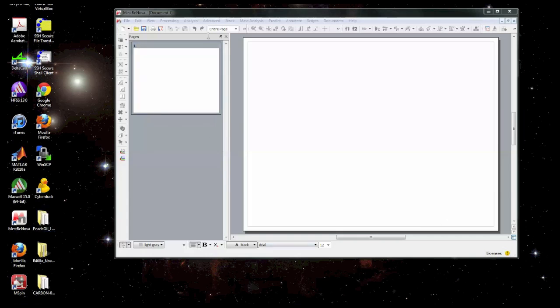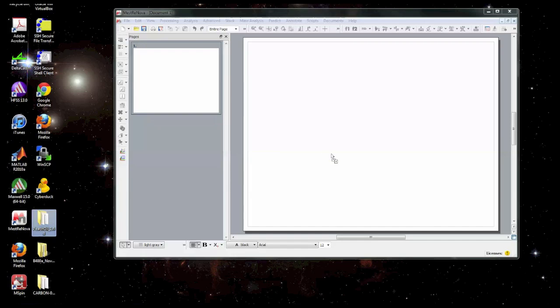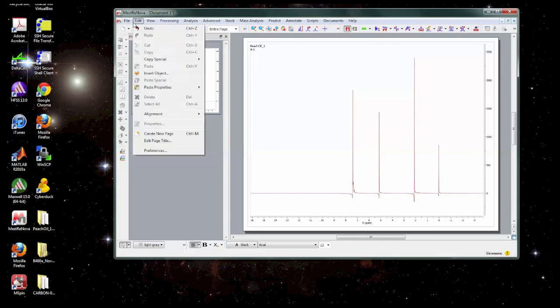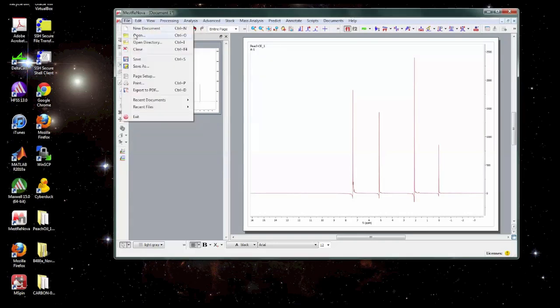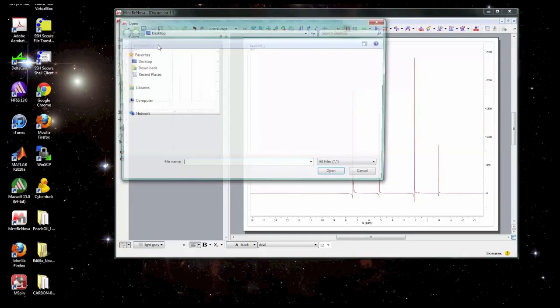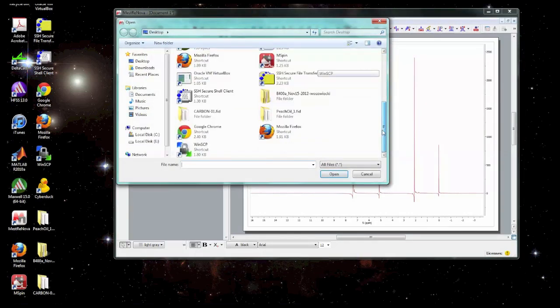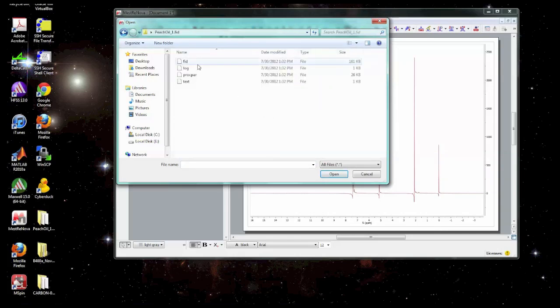Once you have Mestronova open and running you can open the dataset by finding the folder that contains the data and dragging it onto Mestronova and it should open up automatically. Another way you can do it is you can go to the file open menu and you can find the data on your computer and you want to open the file FID. Some 2D datasets are called SER but it's either going to be FID or SER and this is the file you want to open.